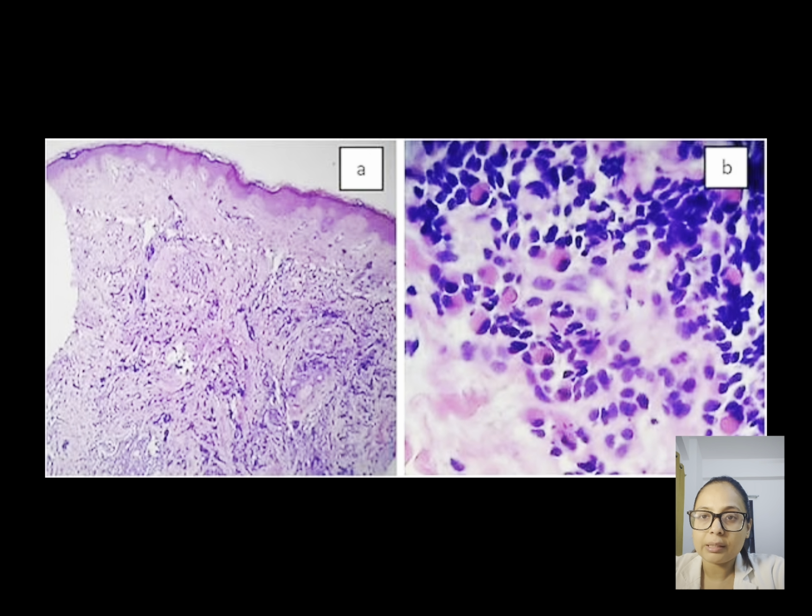Also remember, whenever you are scanning a slide, whenever you want to look into a slide, always start from the low power and go to the higher power gradually. Meaning always start from the scanner view using the 4x.